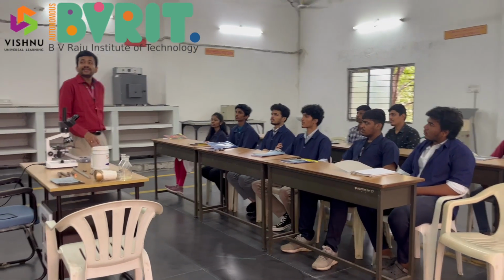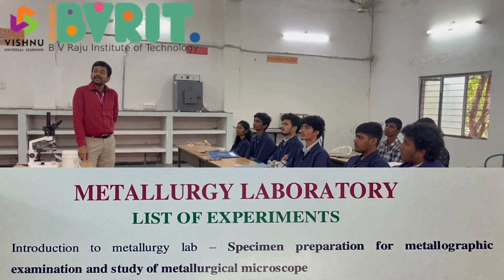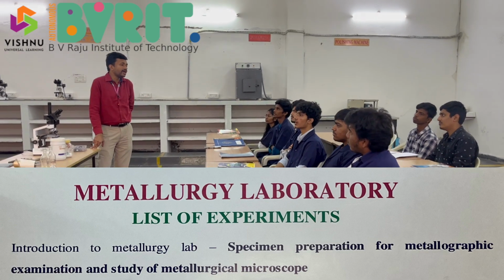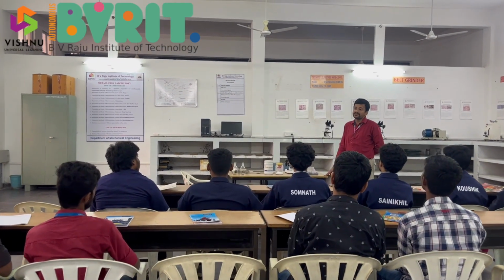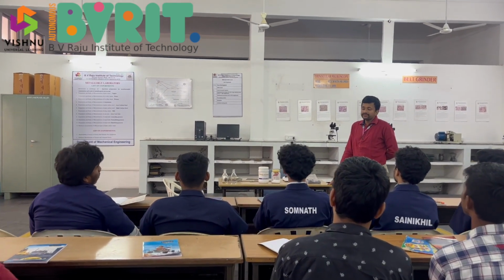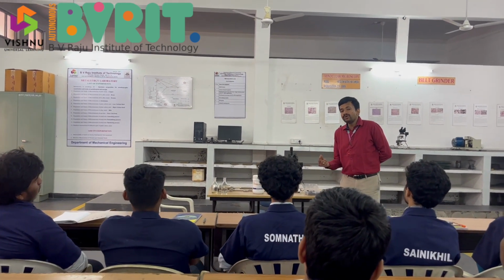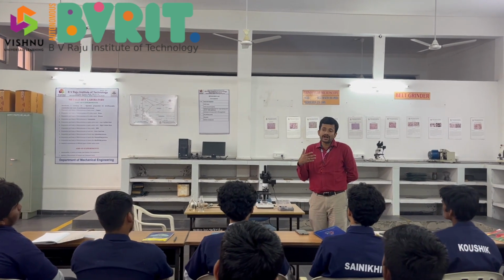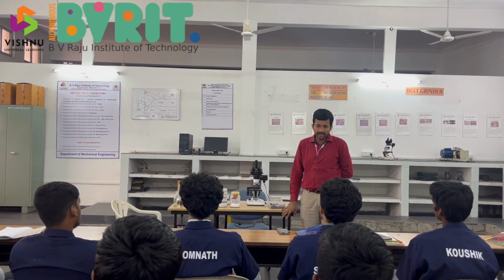So that is the introduction to metallurgy lab, specimen preparation for metallographic examination, study of metallographic microscope. So that is important. So how do you prepare the specimen, and when we complete that specimen, how do you study under the microscope and how do you identify or note the microstructures. That is the first one.